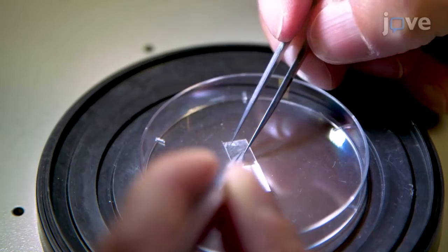Mechanical properties of plant cells are essential to be taken into account when trying to understand mechanisms underlying development. Atomic force microscopy can be used to measure these properties and follow the way they change between organs, tissues, or developmental stages.